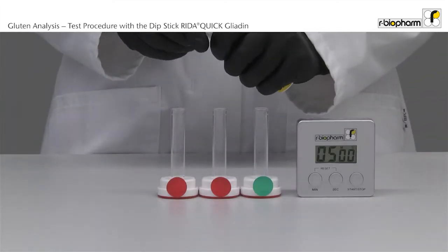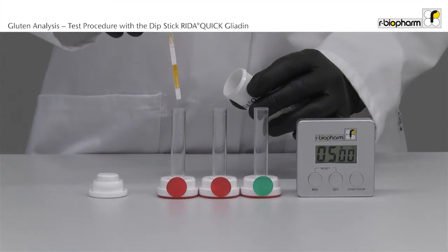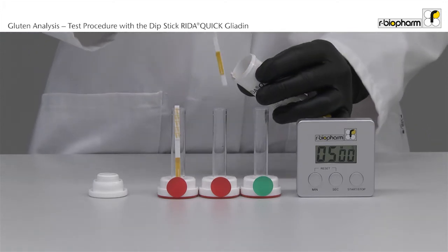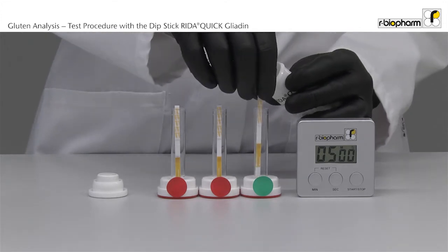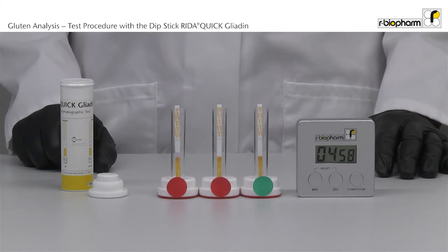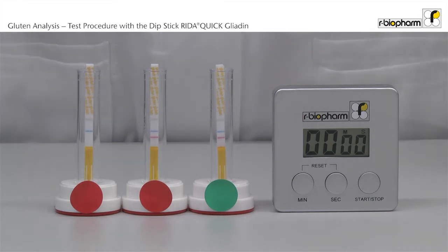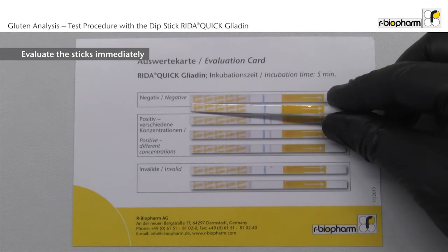Place the dipsticks vertically with the arrow end into the tube. Incubate the dipsticks for five minutes. Take out the strip exactly after five minutes and read the result immediately. Use the evaluation card to read the results.